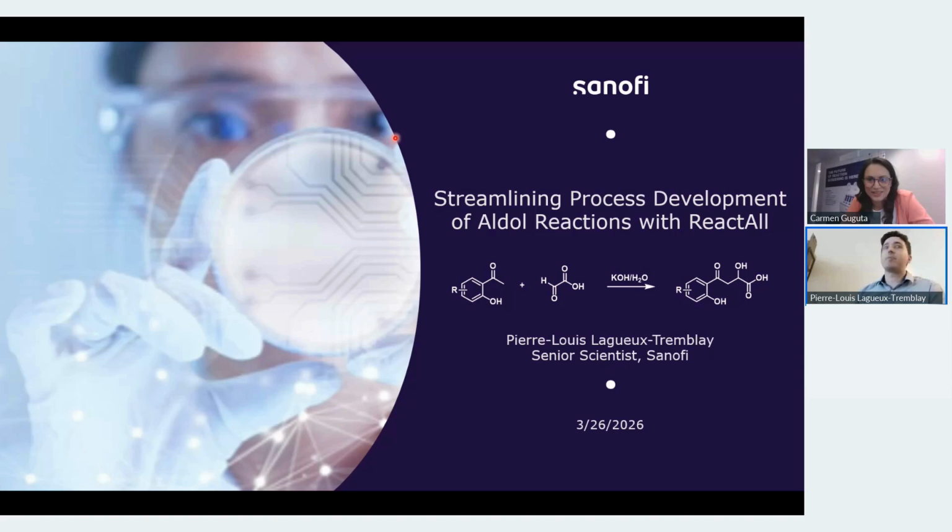And then is an NMR tube experiment going to translate to an actual scale-up process that's going to be, for example, stirred the exact same way? When you move from a very small reaction to a large-scale reaction, you start to see very different things. It's not the same game anymore. So you might not see the same reaction profile at all. Also, you have to be there for the sampling. Even at a large scale, you need to be there sampling with your syringe or your pipette. Someone needs to do it for you, or you have to do it yourself, and then you need to respect a very tight schedule to do so.